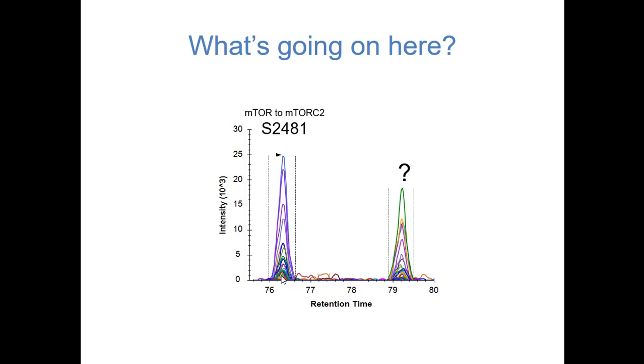So can a peak basically have so much error in it that you actually aren't measuring it anymore? That actually definitely is a problem here sometimes. Actually, it's a much bigger problem in Orbitraps than it is, I think, in TOFs.